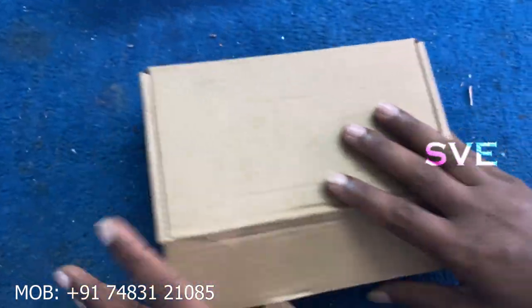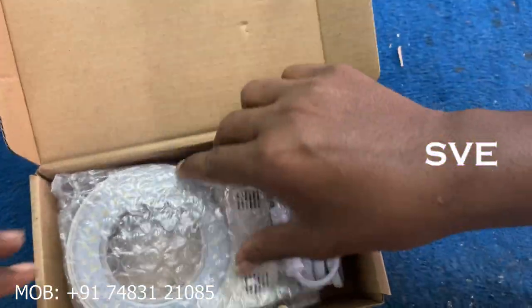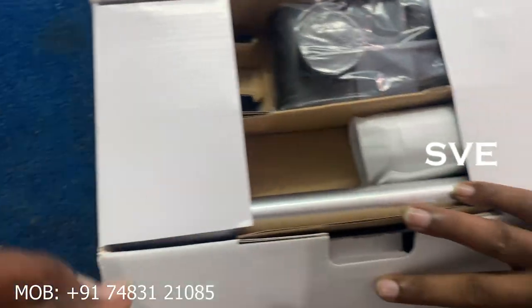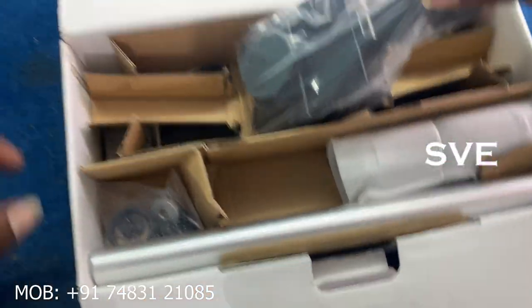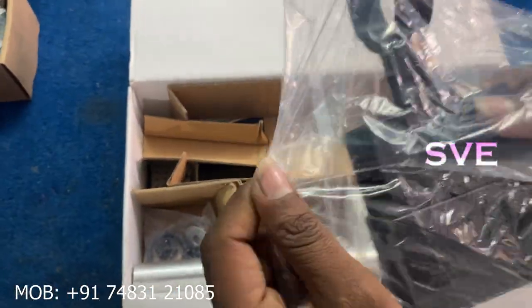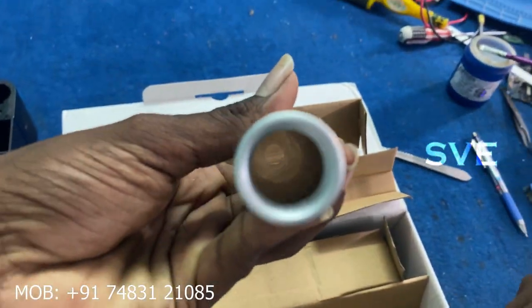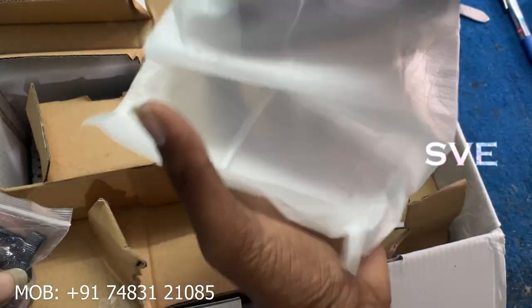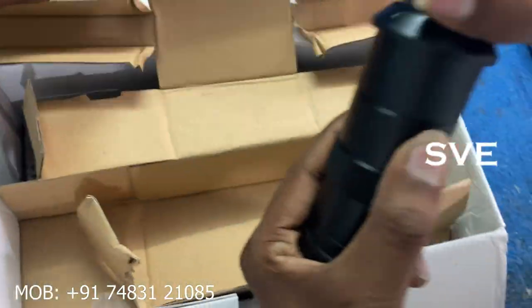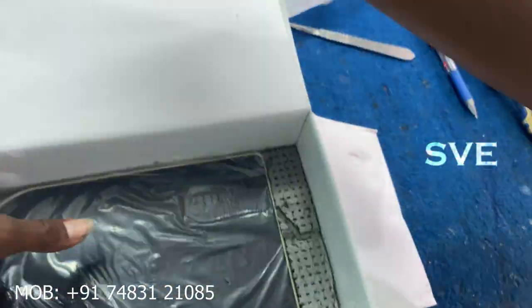The second package contains one LED light. And in the third package, you can get a microscope folder and one rod. This is an aluminium rod. And this one is the main microscope. And this is the base.